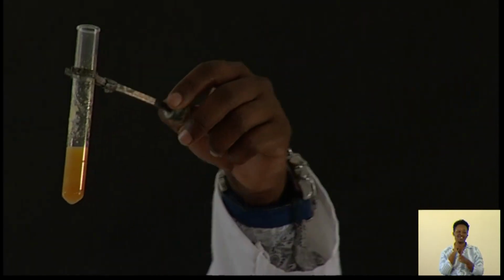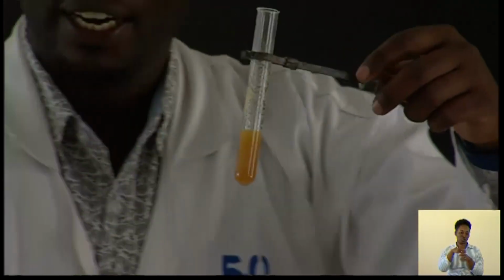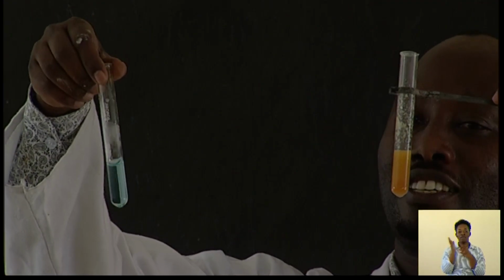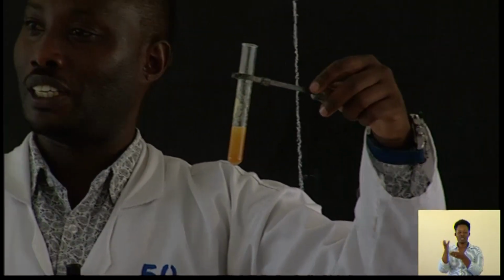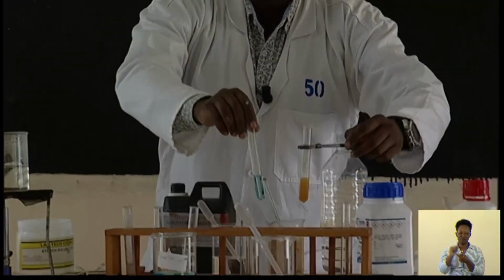The orange color indicates our biscuit contains reducing sugars. But in this one, the color of the Benedict's solution persists. What does it mean? It means that here, there's the presence of reducing sugars, and here, there's absence of reducing sugars. We can make a conclusion.